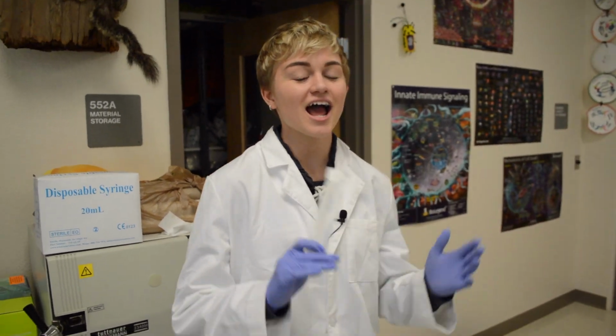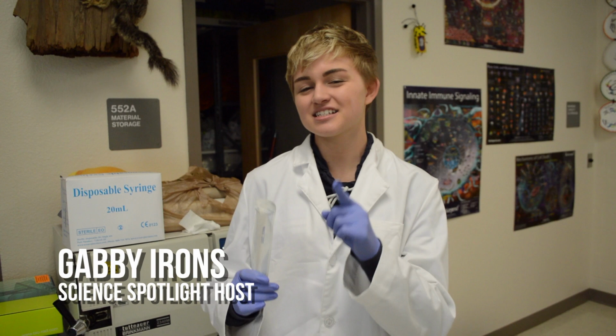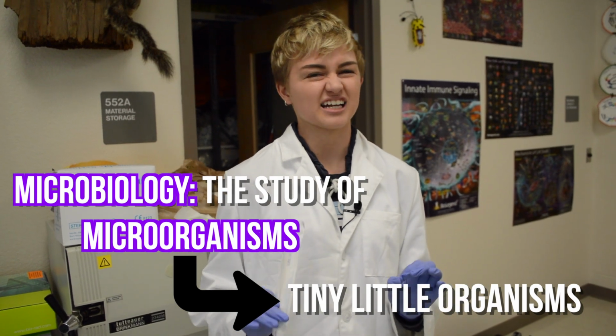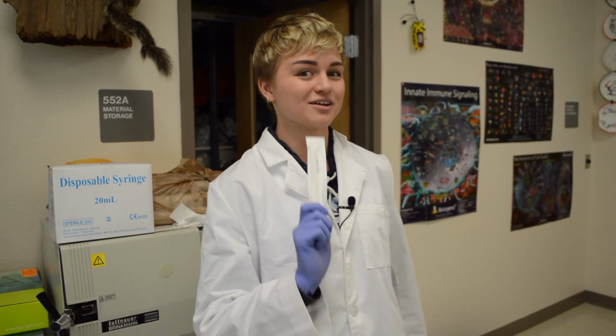Good morning, Lake Nona, and welcome back to another episode of Science Spotlight. My name is Gabby Irons, and today we are going to be diving into quite possibly the best field of science there is, aka my favorite, microbiology. Microbiology is the study of microorganisms. Microorganisms are things that are too small to see with the naked eye, like bacteria, fungi, and viruses. Today, we are going to be swabbing Lake Nona High School to see just how many microorganisms we can find.